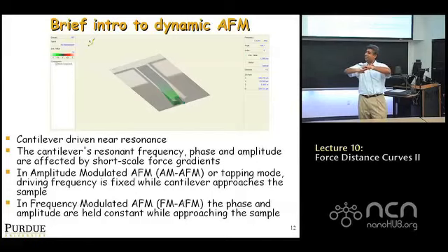Is it a sine function? So if I take a cantilever, just apply a point force, it bends in a curve. Is it a sine function, cosine function, as a function of x? Anyone remember? Is it an exponential function of x? Does it go exponentially? Anyone remember? Got your notes in front of you.